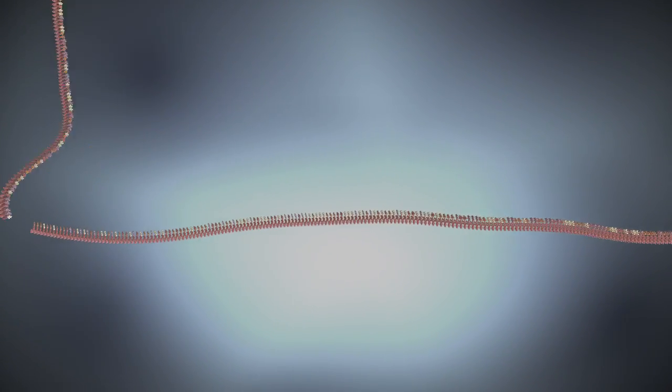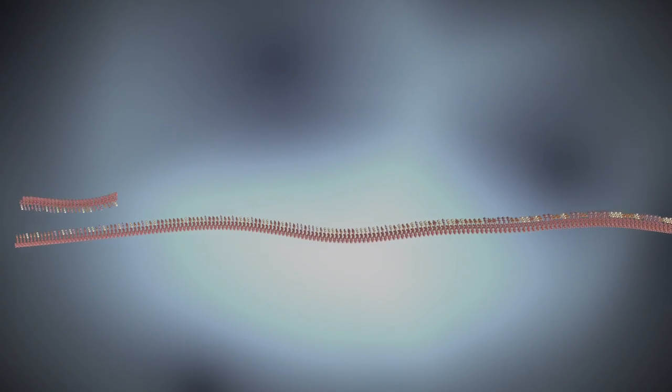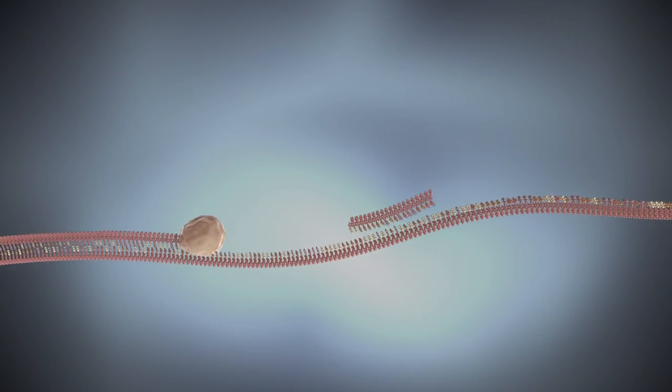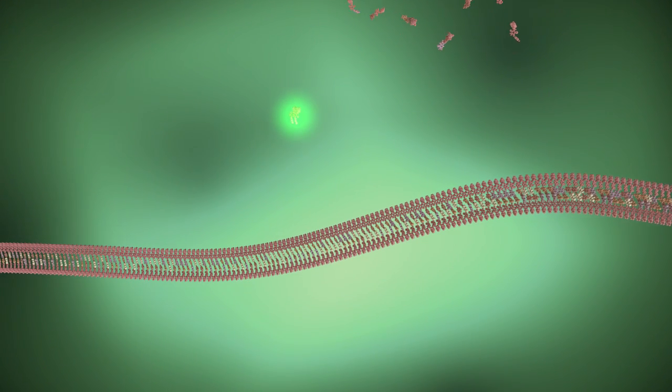PCR is performed on each individual droplet. If a droplet contains the target sequence, it will be amplified, and TaqMan reporter dye will emit a fluorescent signal.